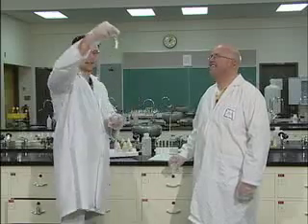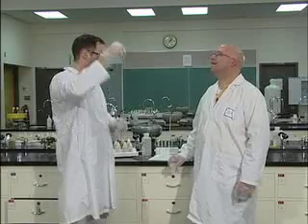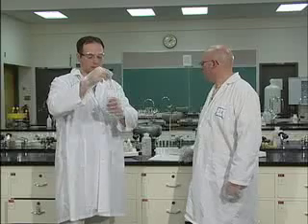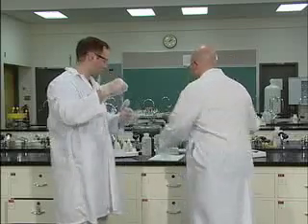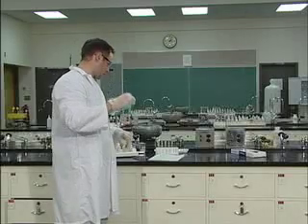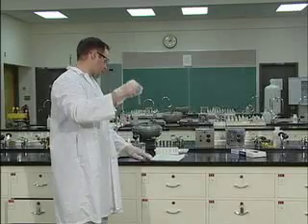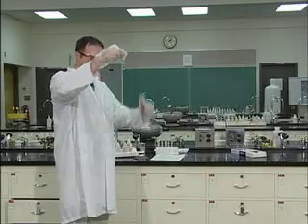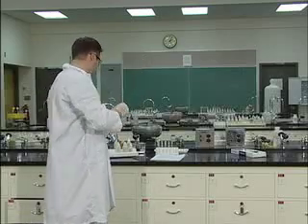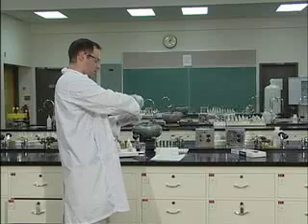And again, we see it's about 6 mils, give or take. Again, it's a clear solution. Make sure, and I can't stress this enough, each time you're making observations, you note that it started off as a clear solution. To that, this is C number 2, and it tells you all of the steps in your lab book. To C2, we are going to add ammonium hydroxide, NH4OH.